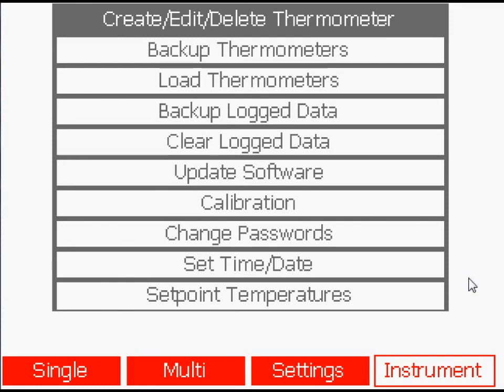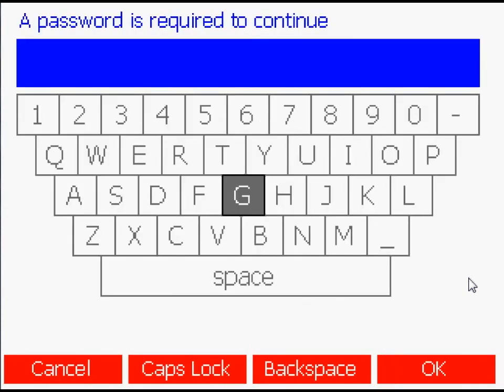Use the up and down arrow keys to select the required function and then press the enter key to open a new window and start that function.